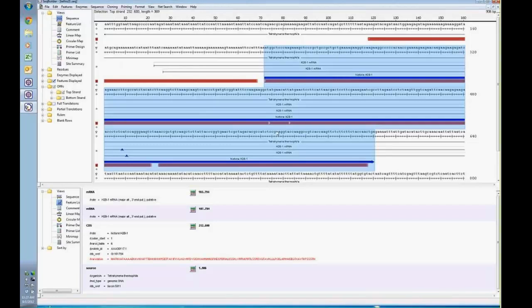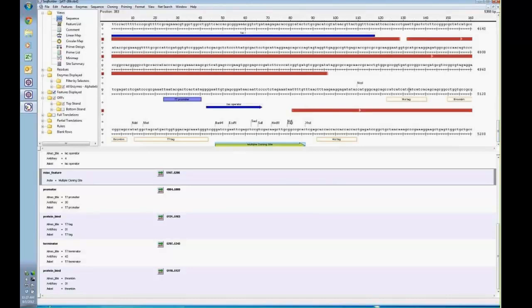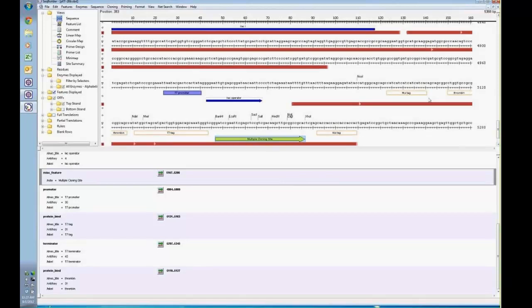Before we do that, let's just go back to that vector. I'm sorry for the confusion here, but we need to pick those enzymes. So the two enzymes that I want to pick here are the NdeI and then the XhoI restriction enzyme sites. The result of this is basically I'm going to have a thrombin cleavage site, and I can use this histidine tag here for purification. Then depending on this protein, I may want to cut it off the column using thrombin or so forth, to where the end result is potentially almost a near native target for downstream analysis.